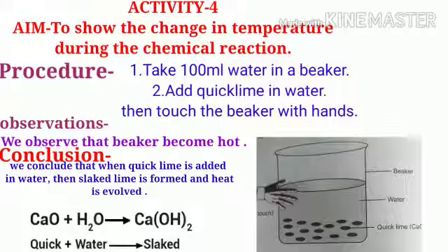This is the conclusion, students. We conclude that when quicklime is added in water, slaked lime is formed and heat is evolved. That's why the beaker becomes hot. So, this activity shows that temperature changes during the reaction.